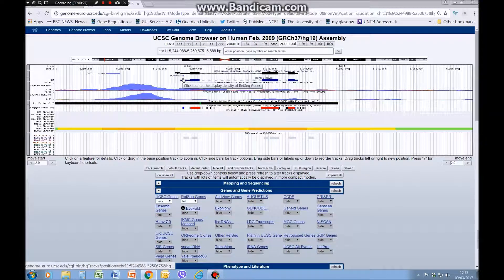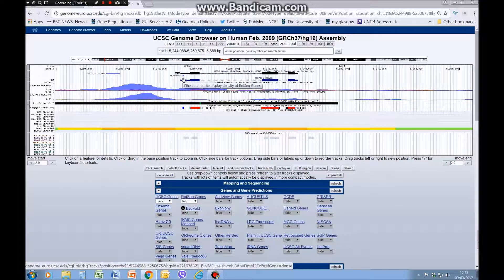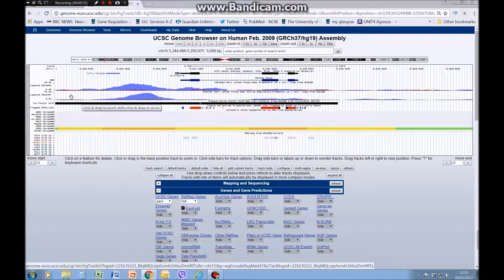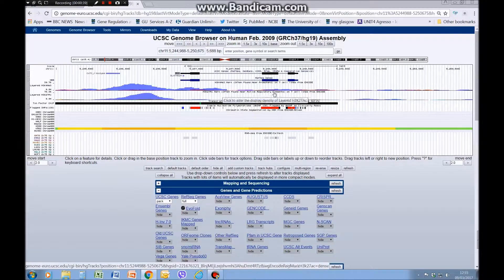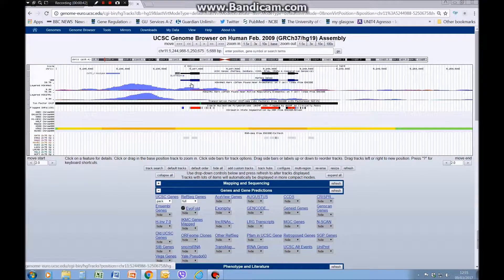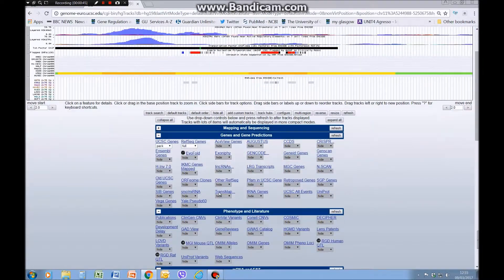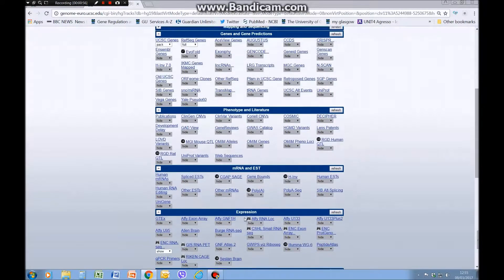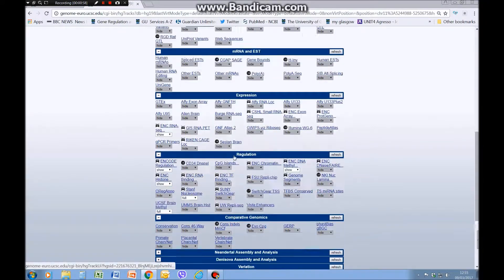The first thing you need to do is to view your genes. The view you get when you start up will probably look different to this, so you might want to get rid of tracks which are not relevant and show your genes if they're not displaying appropriately. Down here we have different folders with different menus — here's a genes and gene prediction menu, and within it are all the different track sets related to genes. We have mRNA, expression, regulation, etc.